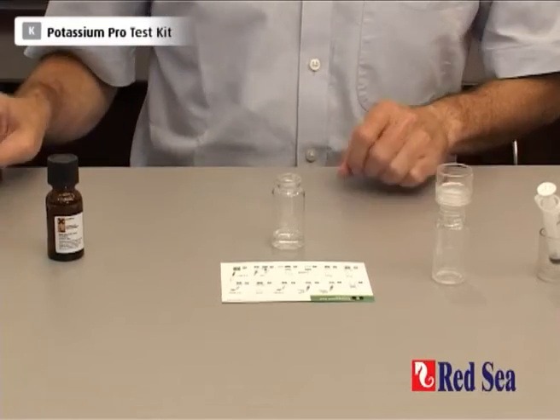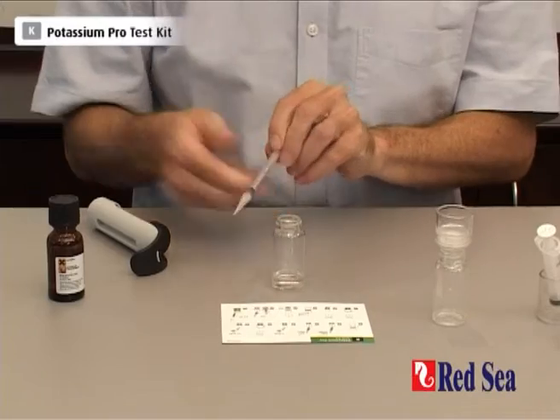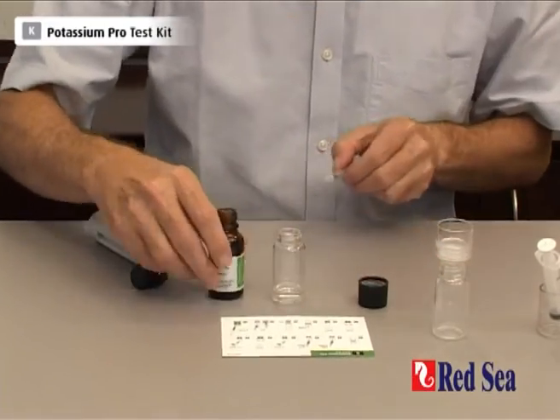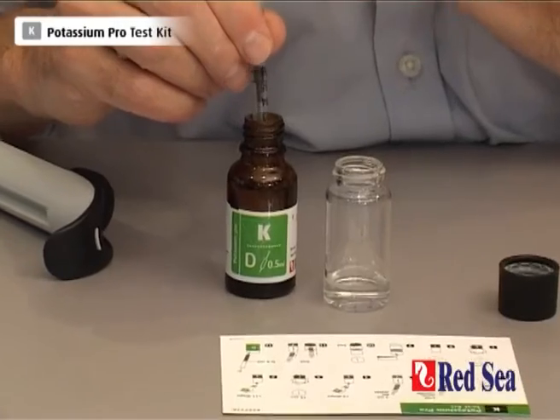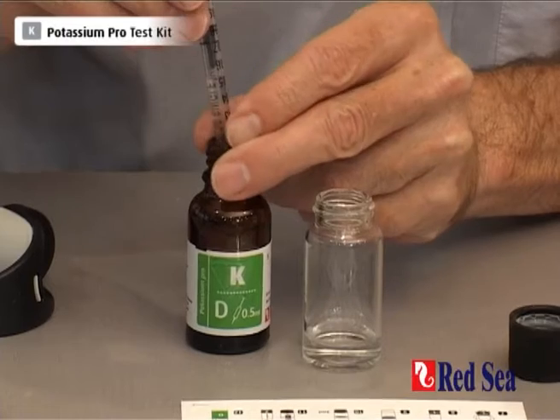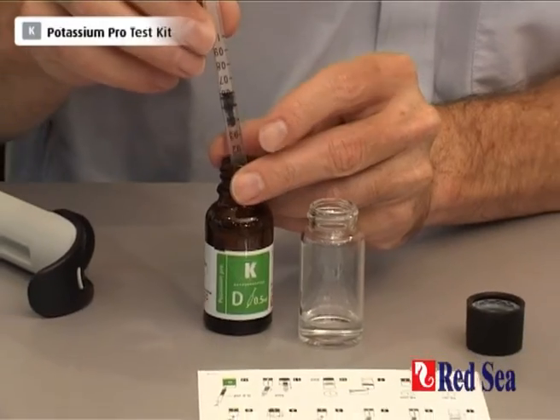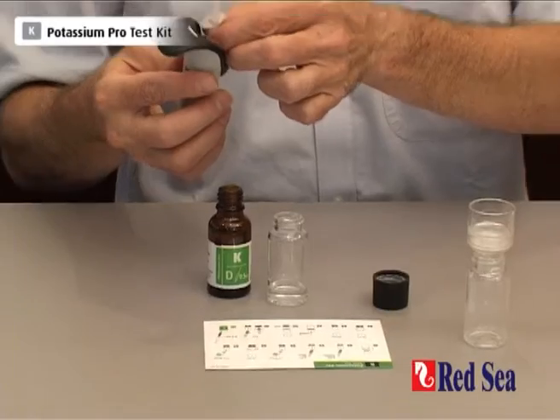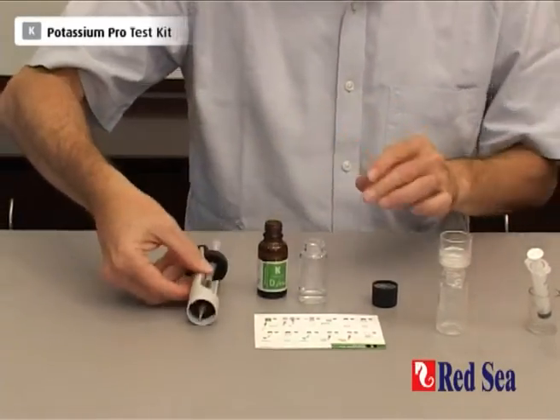The next thing we have to do is get our titrant ready. We take our titration syringe and we're going to take exactly 0.5ml of titrant into the syringe. Remember to keep the tip in the liquid at all times. We're measuring the 0.5ml with the bottom of the plunger — and there we have the plunger at 0.5ml. Let's put the syringe into the titrator and put it on one side until we're ready to use it.